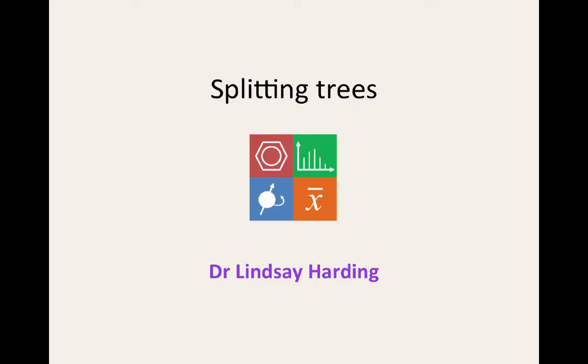Hello and welcome to this screencast which explains how to draw splitting trees for the different types of hydrogen in a molecule to help predict line shapes of signals in the proton NMR spectrum.